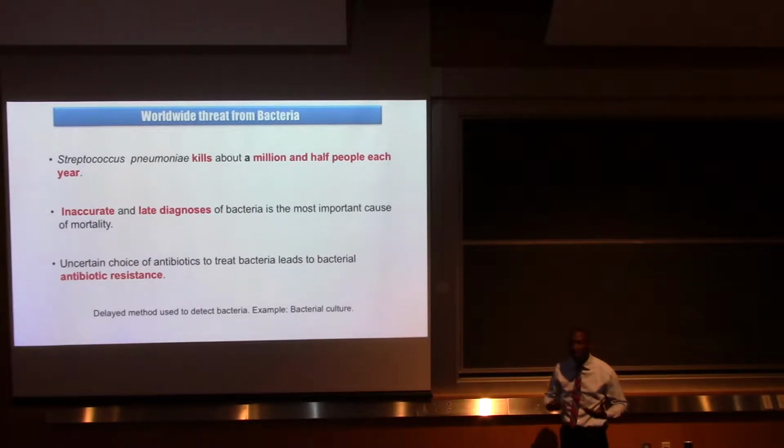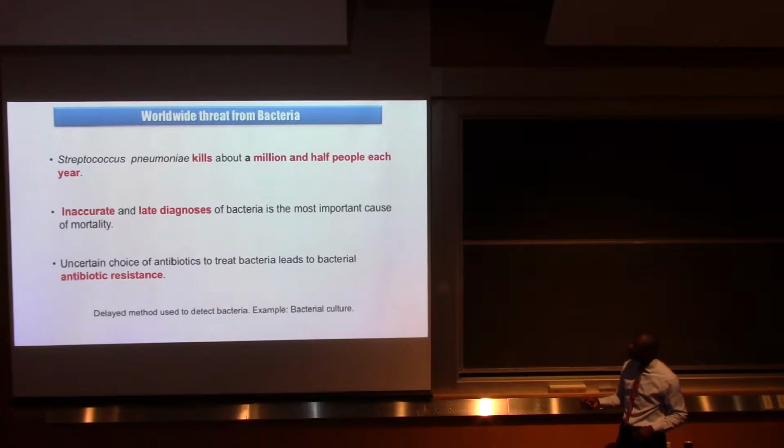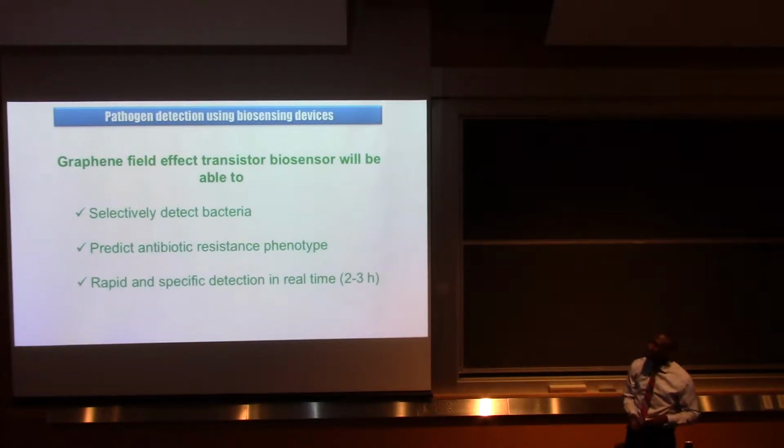Also, some other techniques and detection methods are used to detect these bacteria. For example, we have the bacterial culture. This method takes a longer time to detect bacteria. So, in our project, we are developing a biosensor device to selectively detect these bacteria in the shortest time frame.